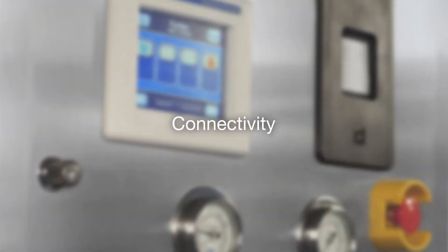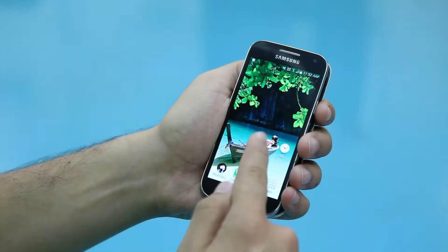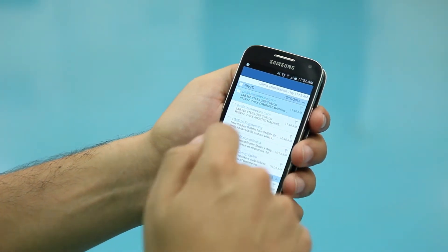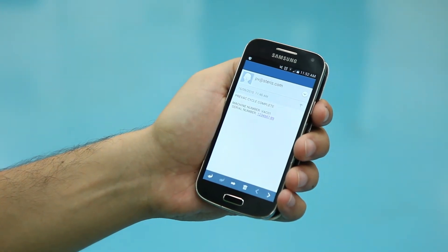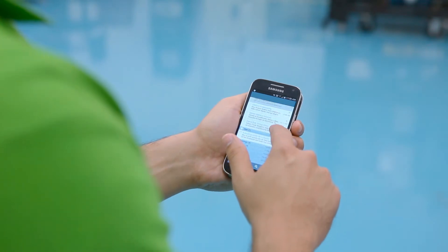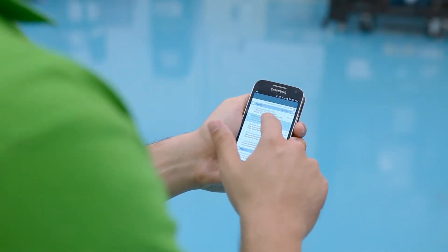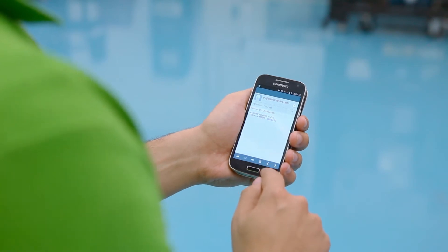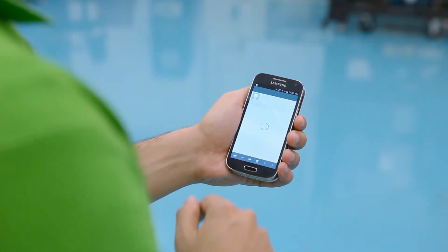Stay connected to what is happening in the laboratory while you are away by receiving email or text alerts on the status of the autoclave. This is a standard feature that is easy to set up on any AMSCO 110LS or 250LS connected to the internet. The AMSCO small LS series sterilizer can also interface with any building management system.